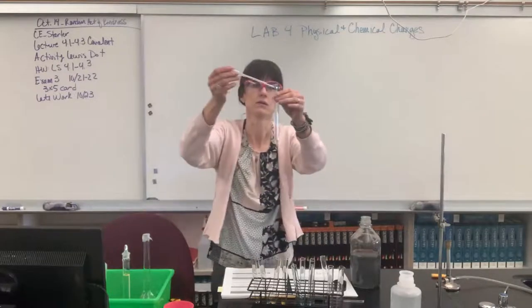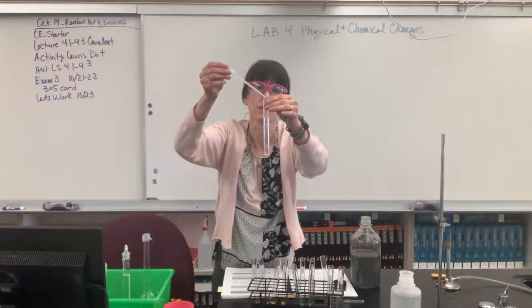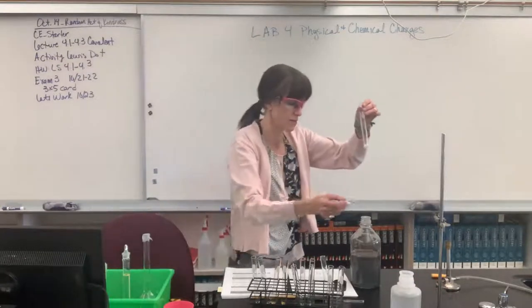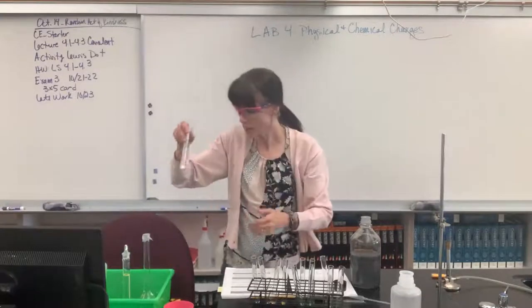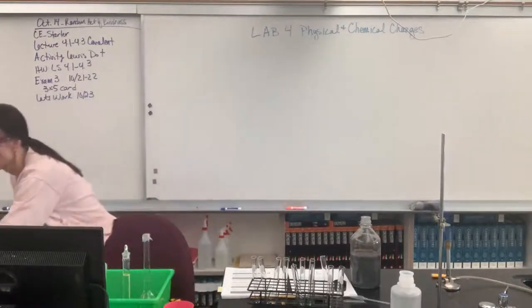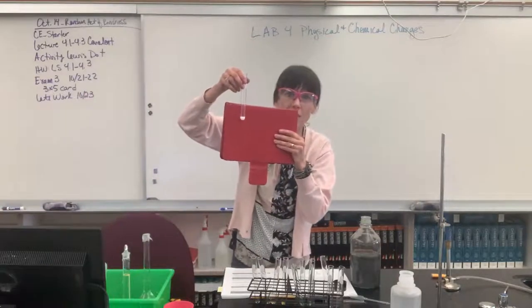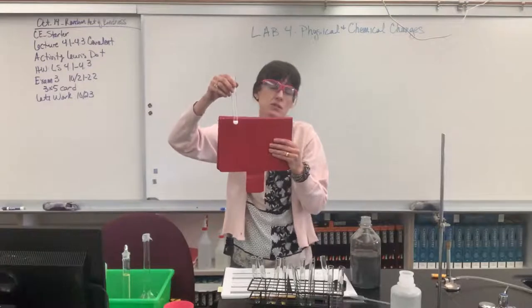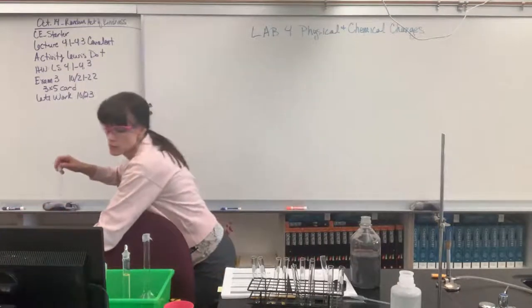Okay, so here we go. One. Oh man, that turned fast. Two. So you can see the white. Let me, I'm going to use my iPad. Look how white that is. Wow, it went from clear, I mean, it just looked like clear water, to white. So let's record that.